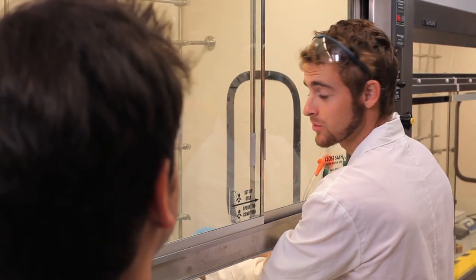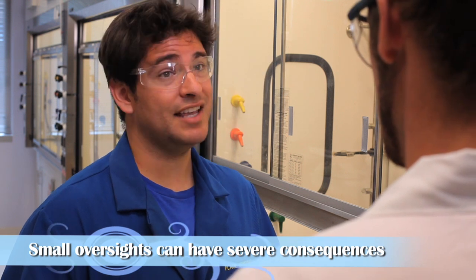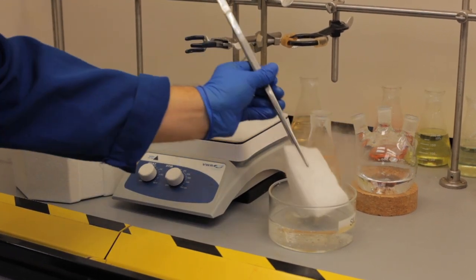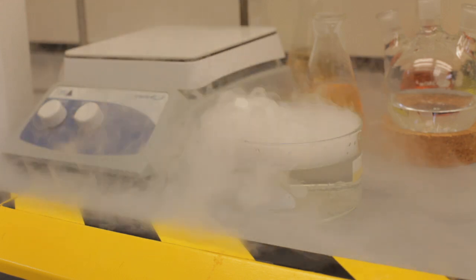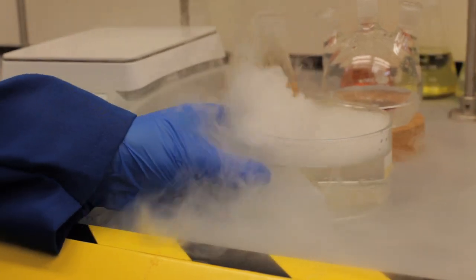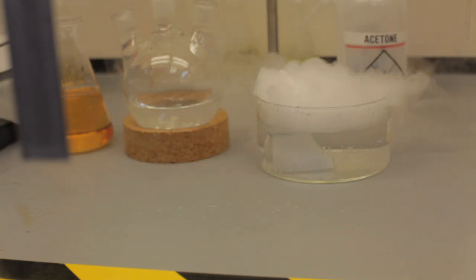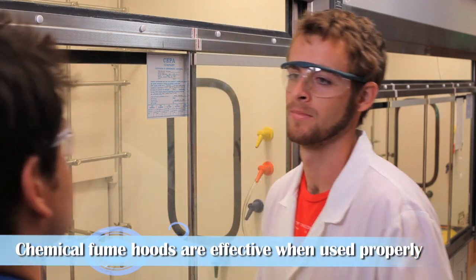Hey Nathan. Hey Professor, how are you? Why aren't you wearing your safety glasses? Sorry, they just fogged up for a second. I know you didn't mean to do it on purpose, but what if your neighbor drops something and a piece of glass goes flying towards you? It's pretty dangerous. If you need to clean your safety glasses, just go outside, clean them, and come back in. Also, I noticed you're working too close to the edge of the hood — that's not safe practice. Look at the dry ice fog: see how it behaves when the dish is close to the edge and especially when the sash is wide open? Think about all the hazardous vapors that will escape into the lab. Pushing it into the hood about six to eight inches and bringing the sash down makes a big difference — it better protects you from both hazardous vapors and flying debris should something go wrong in the hood. Thanks, Professor. That made a lot of sense.